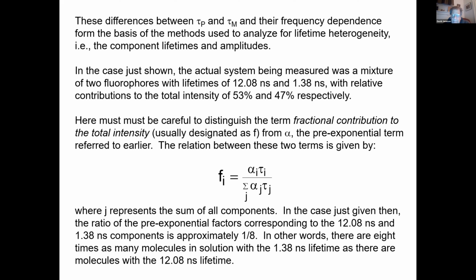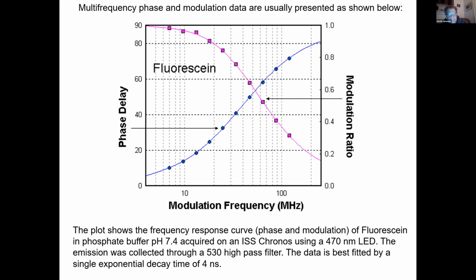Well, some people, let's say, are interested in how many molecules have a certain lifetime. Others of us often are more interested in what fraction of the photons I'm measuring have one lifetime and what fraction have another lifetime. Okay, but it depends what you're doing.